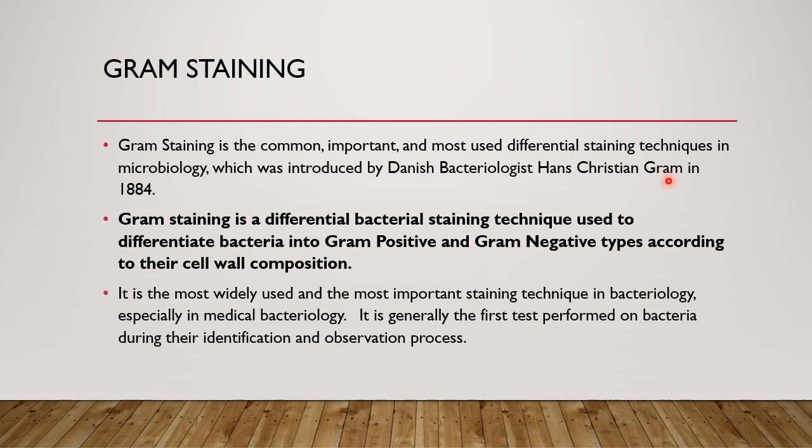So yes, in the previous video lecture we studied in detail what staining is. It is a method of coloring, and we also studied why staining is required, and the different types of staining: simple staining, where one stain is used, and differential staining, where many stains are used. All those things we studied in detail in the previous video lecture. So here we'll study in detail a differential staining technique which is called gram stain.